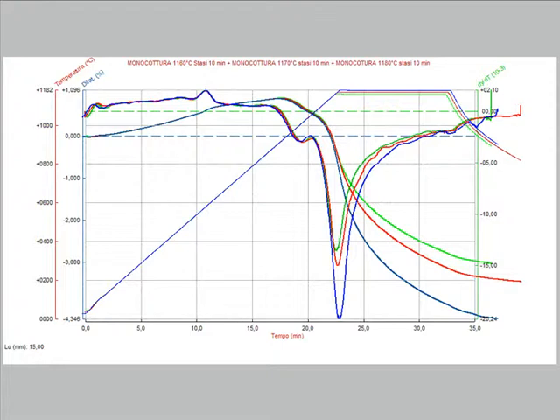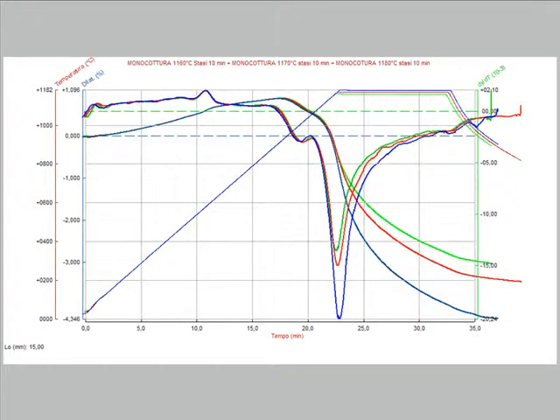The derivative of sintering against time or the sintering speed is showing that the sintering speed is growing exponentially with temperature, but it decreases exponentially at constant temperature.